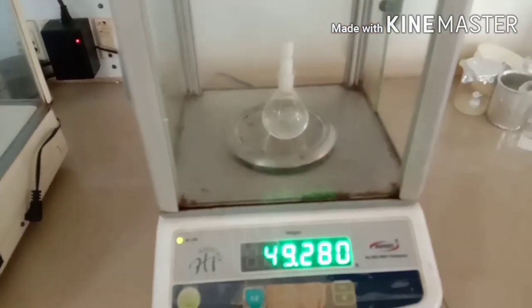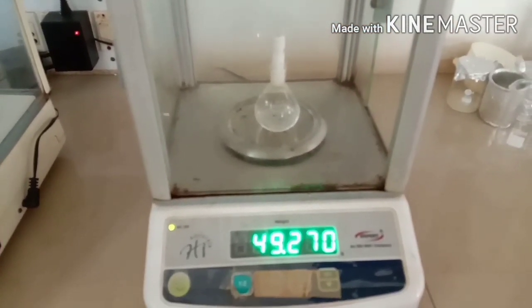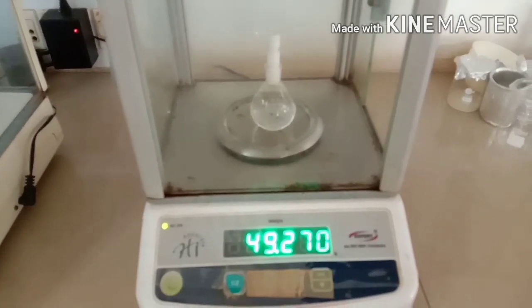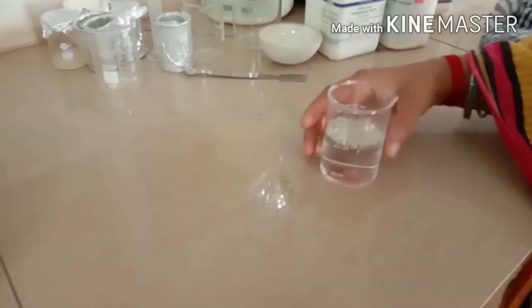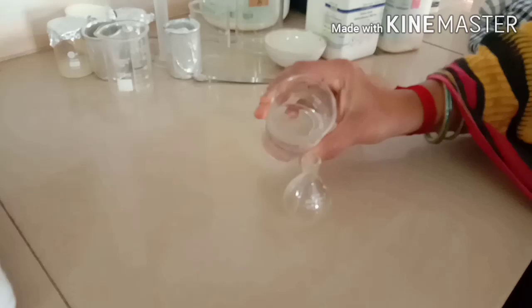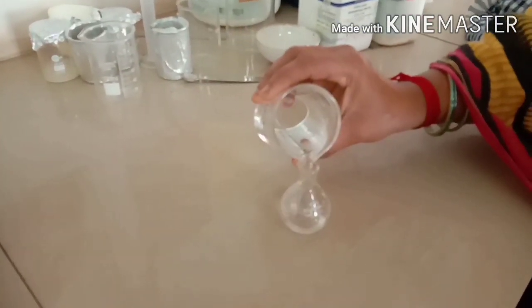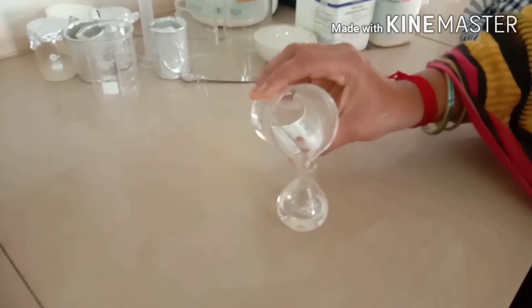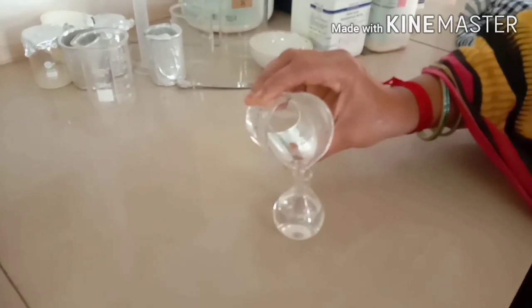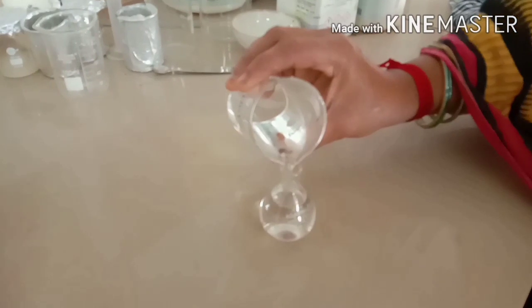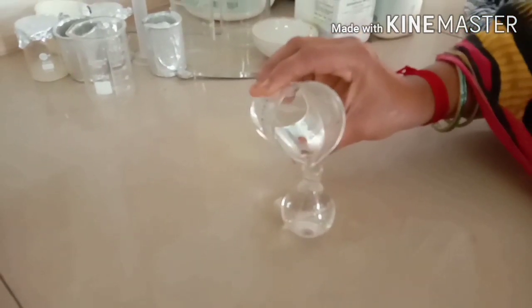Then wash with the unknown liquid. Then once again fill it with the unknown liquid and once again weigh, that is W3, weight with the unknown liquid. Then you calculate the density of water.